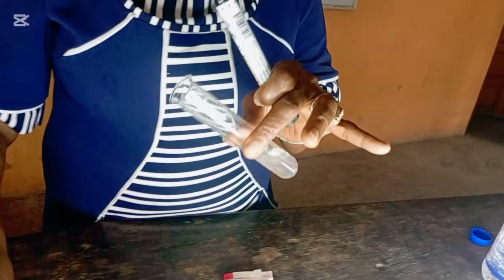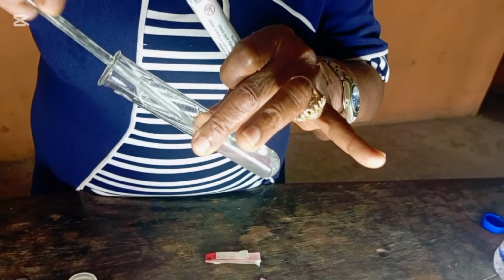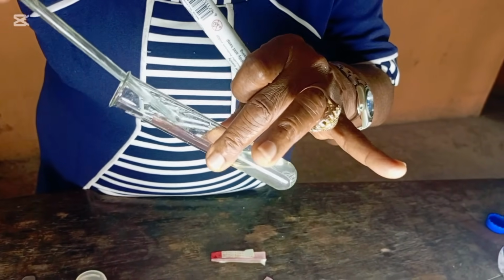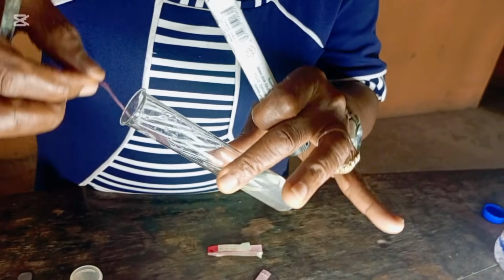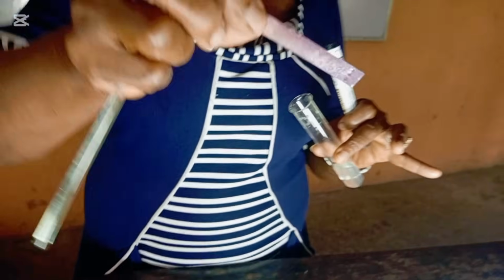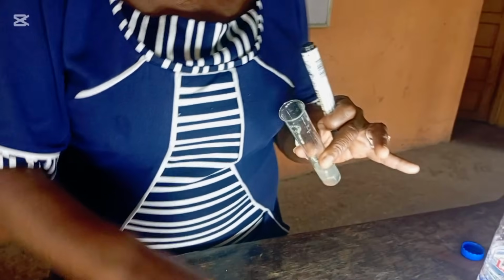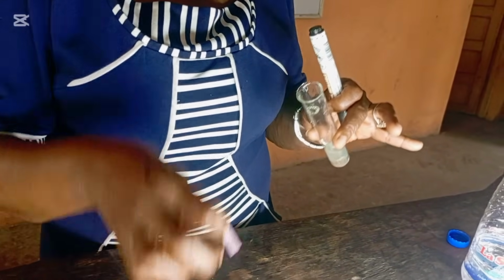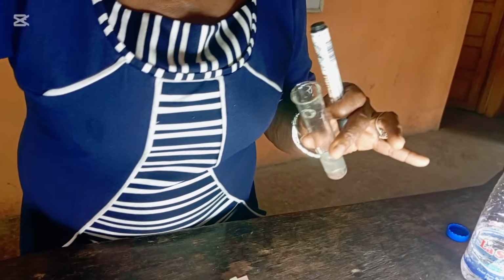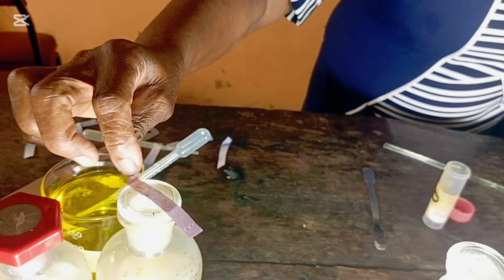So you don't need to waste time. The litmus has touched the solution, so you leave it for a while. The blue color will appear. That's it. It turned the red to blue. The blue is faint, but it turned it to blue. Let's keep it somewhere. You can see it's blue.